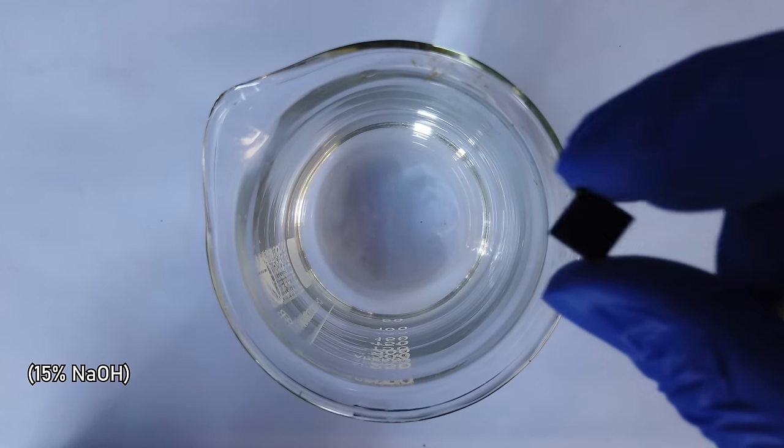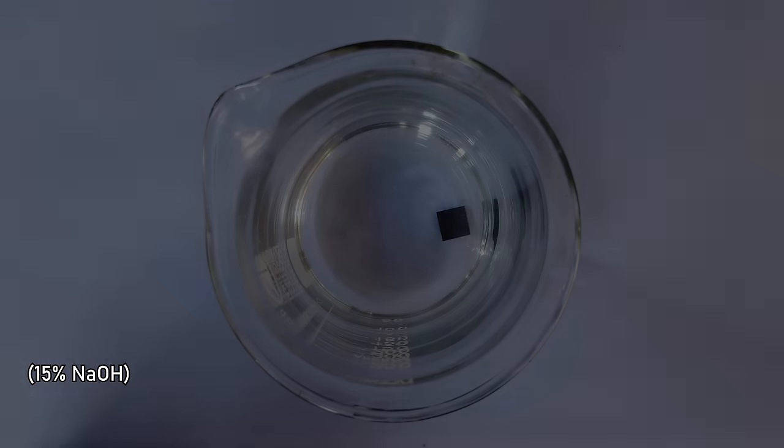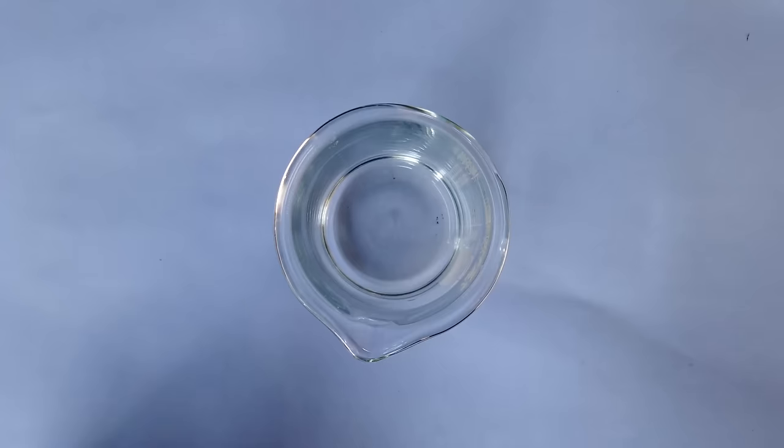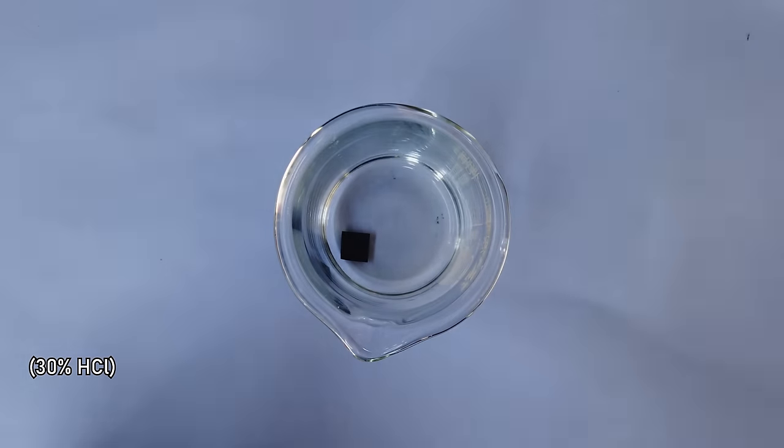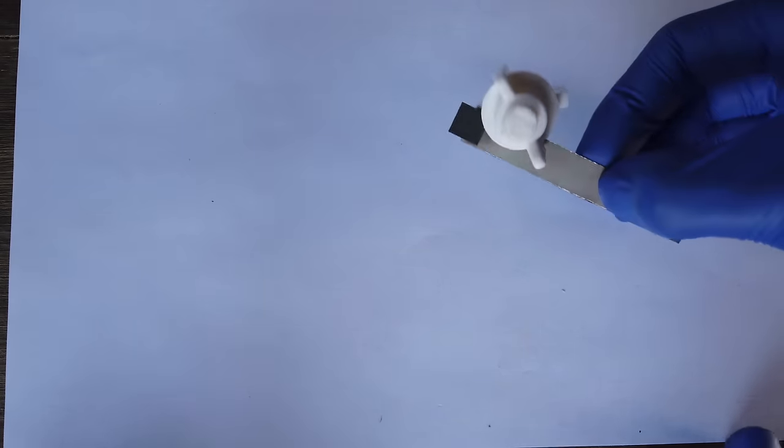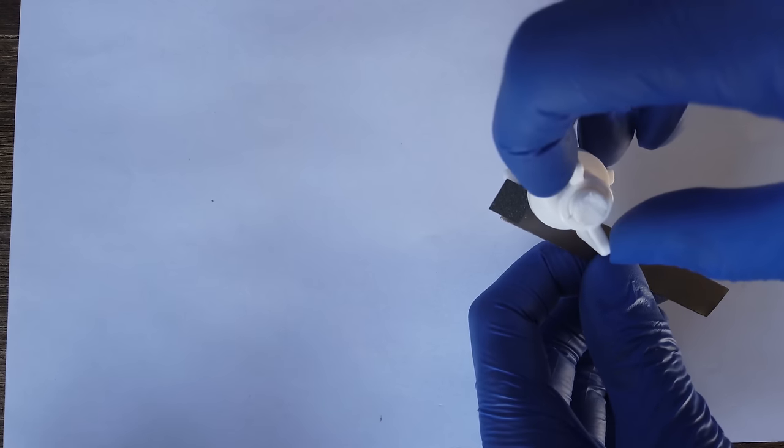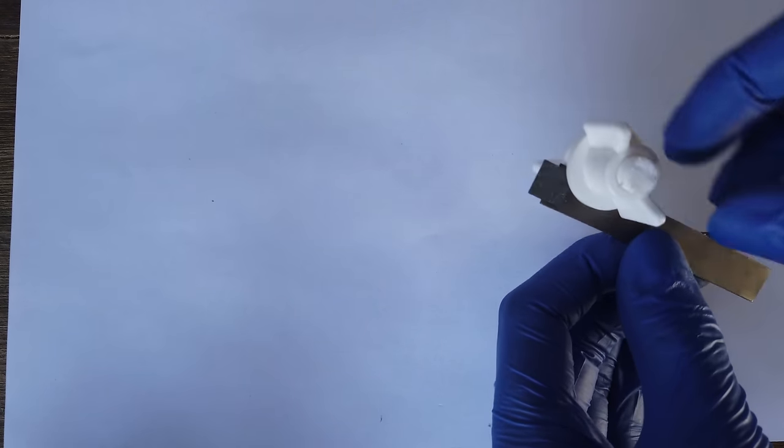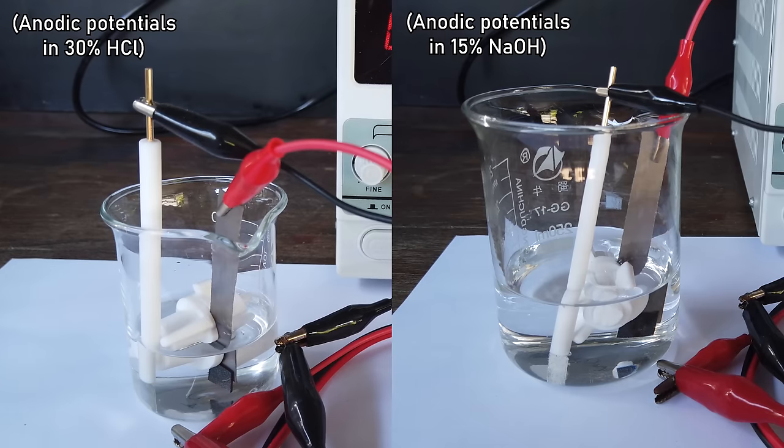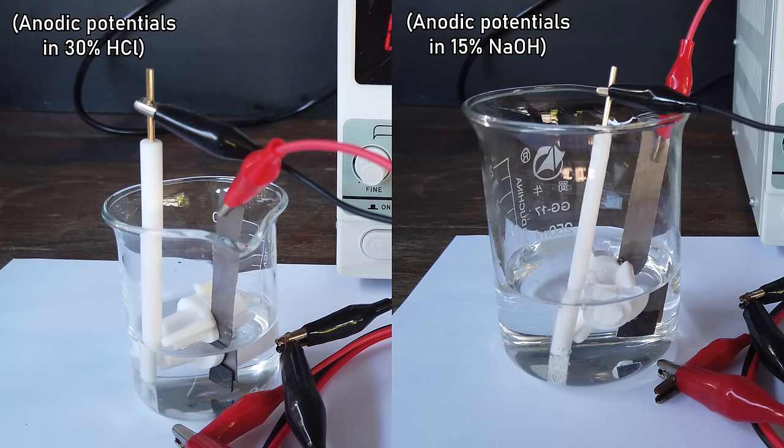We can chuck it in strong base, nothing. We can chuck it in strong acid, nothing. What other chemical tests are there that we could do? I suppose we can put it under strongly oxidizing potentials for both of these conditions as well. What I've done here is I've got a strip of titanium, a little thing to clamp down the diamond onto the end of it, and we've made ourselves a little boron-doped diamond electrode here. We also see no degradation in either case, even when using this thing as an anode.